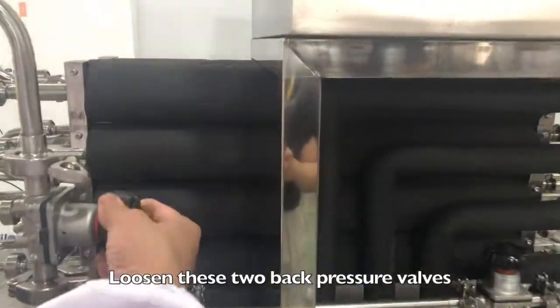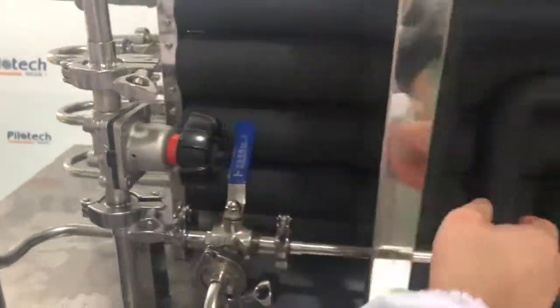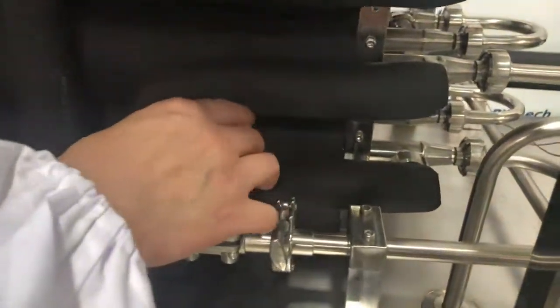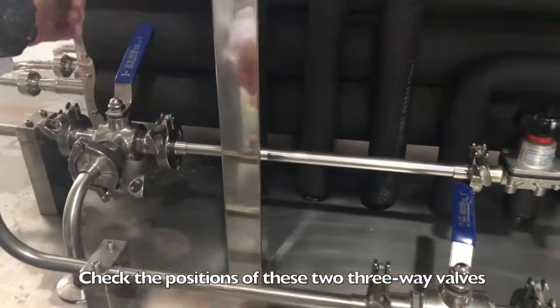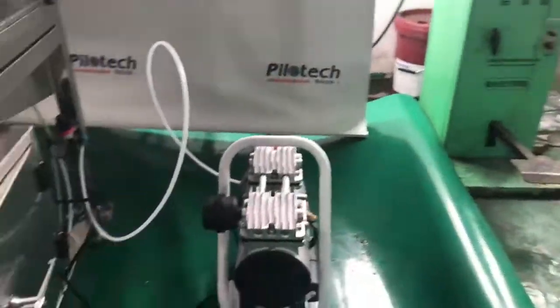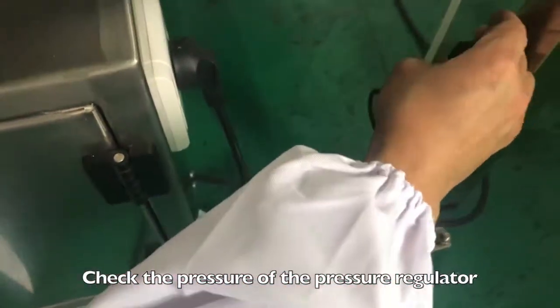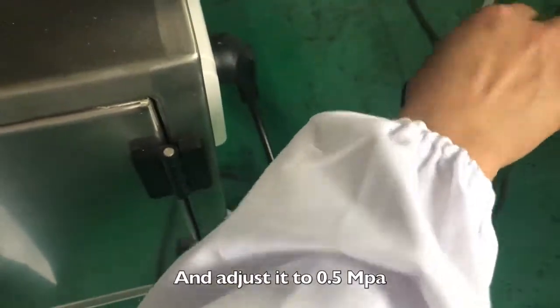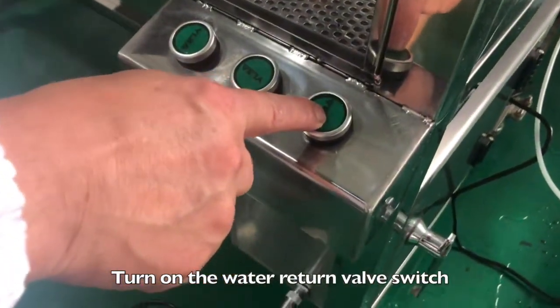Loosen these two back pressure valves. Check the positions of these two three-way valves. Check the pressure of the pressure regulator and adjust it to 0.5 MPa. Turn on the water return valve switch.